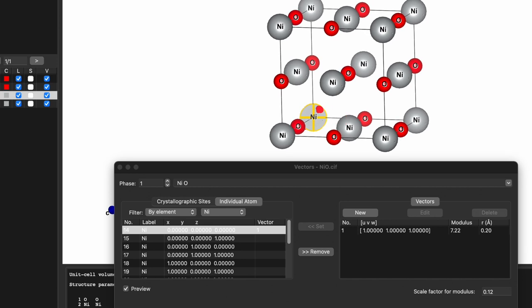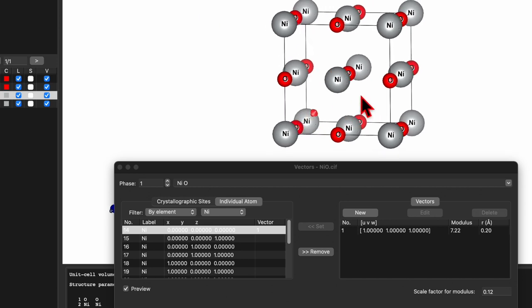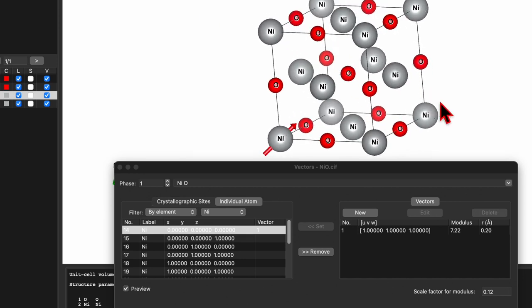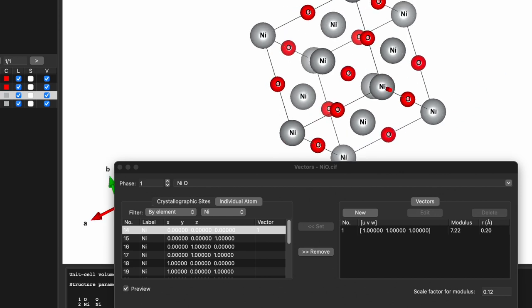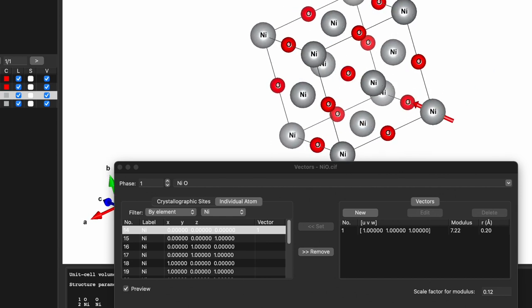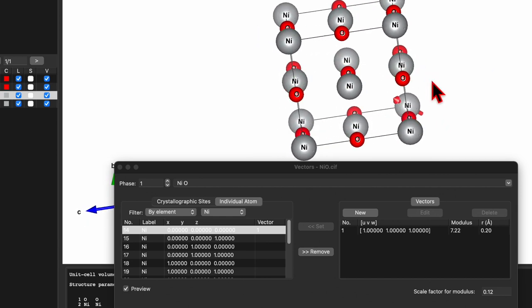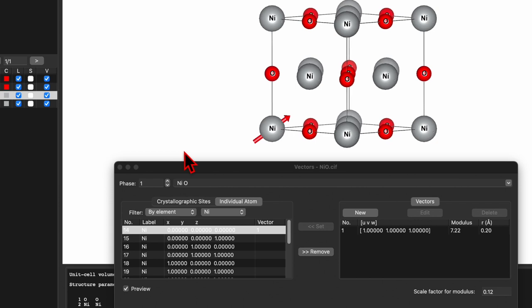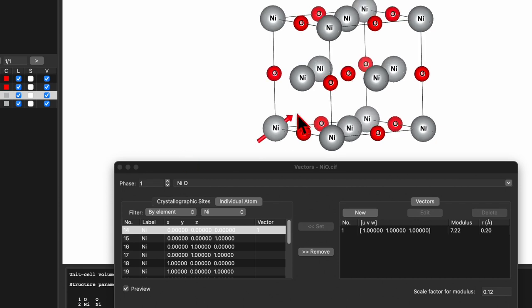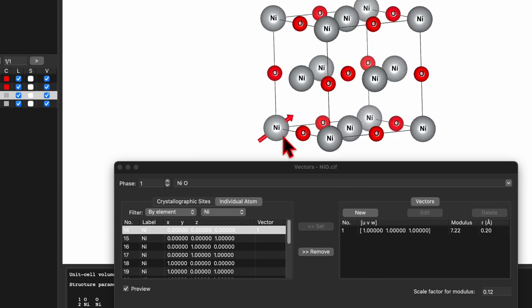You can also choose the arrow style — let's see how it looks. This is the origin point 0 0 0 and we have already created a vector for this atom.